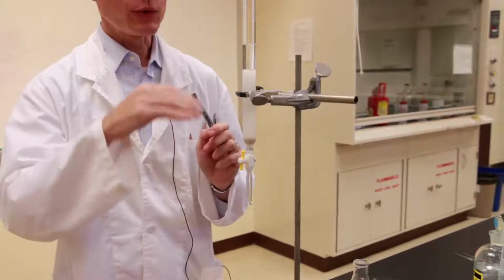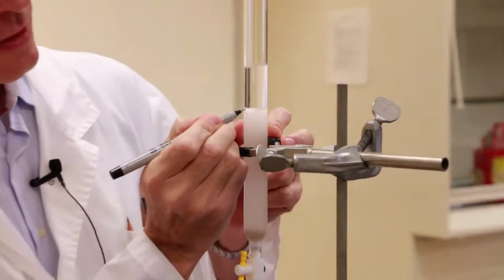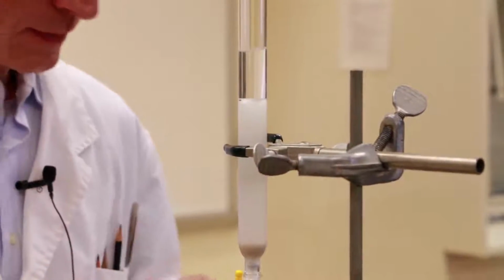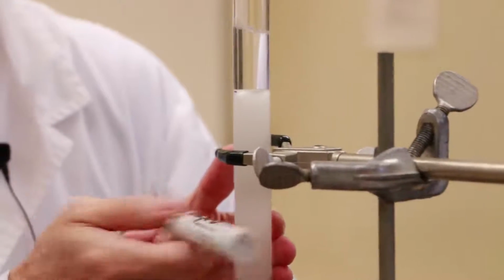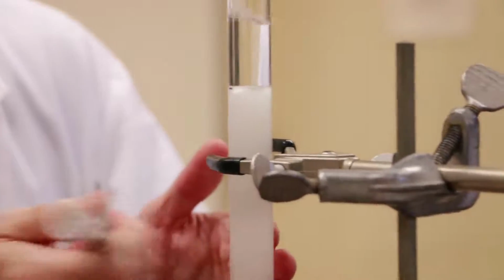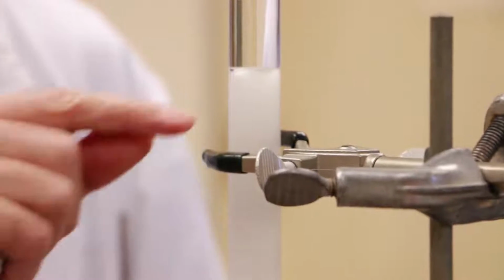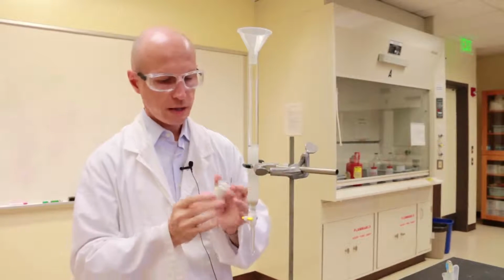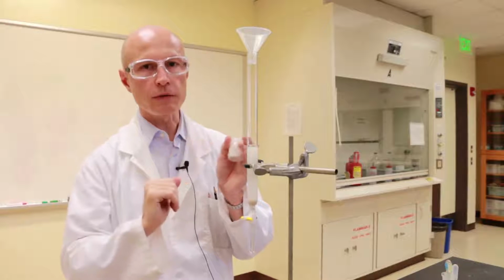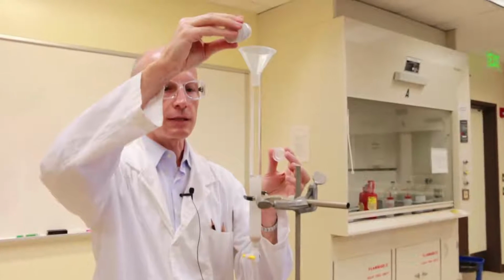To be able to watch the silica gel settling, it is actually helpful to mark the level of the silica gel with a Sharpie. And while the solvent is going through, you keep gently tapping the sides to help settling. In theory, you should keep running solvent through the column until the silica gel stops settling. When you have about 5 millimeters of solvent on the column head, you want to close the stopcock, and you need to add a little sand on the top of the column in order to protect the silica gel. And a couple of millimeters are enough.